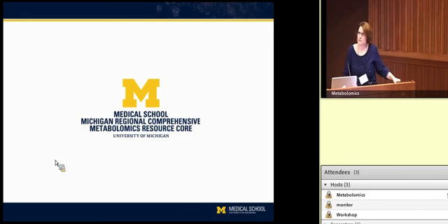When you talk about untargeted versus targeted analysis, are you essentially doing the same experiments, with the mass spec? A lot of times the extraction method is not different. The difference is, as I showed, what kind of standard you use, and how you analyze the data. In this case, the instrument is different too. The instrument that runs untargeted is slightly more sensitive, so we're going to pick up some lower level peaks that we aren't necessarily going to want to report in a targeted assay because of the sensitivity.